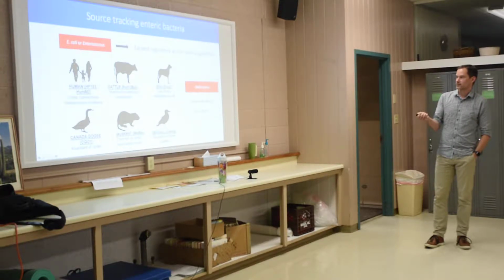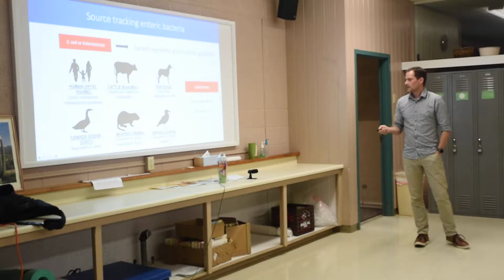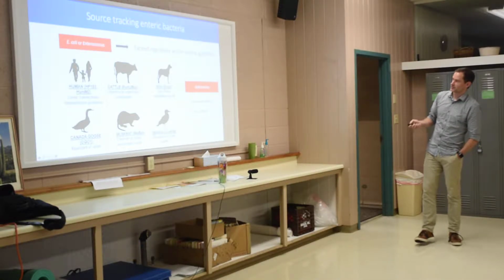And when we do a source tracking test, we typically use HF183 for human detection. We use rum2bac for cattle. We use dog3, Canada goose, so CGO1. We have a muskrat one because we have lots of muskrat up in Alberta lakes. And we use a seagull marker. And for Enterococcus, those source tracking tests would be triggered if you exceeded 640 cell culture equivalents, and the limit is exceeded if you have 1,280 cell culture equivalents.